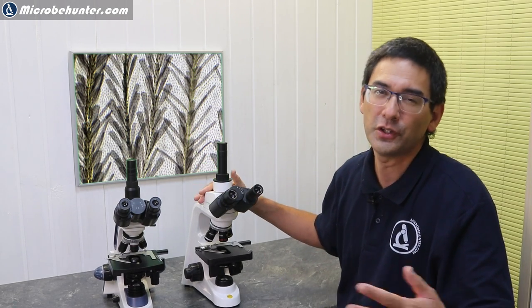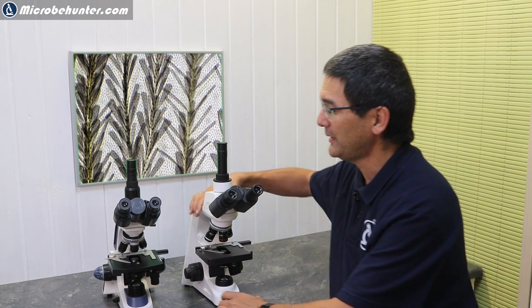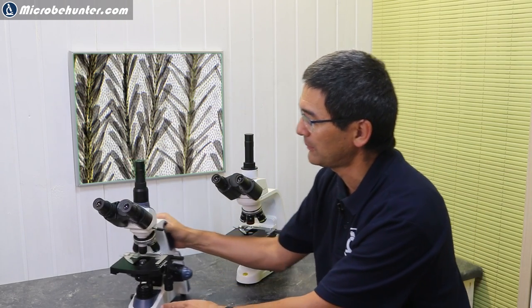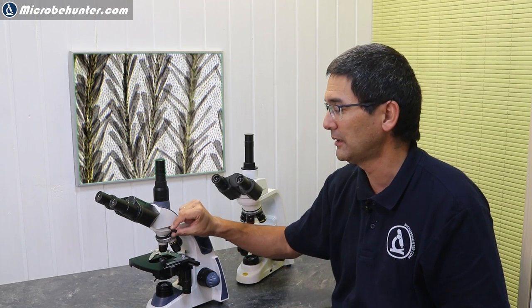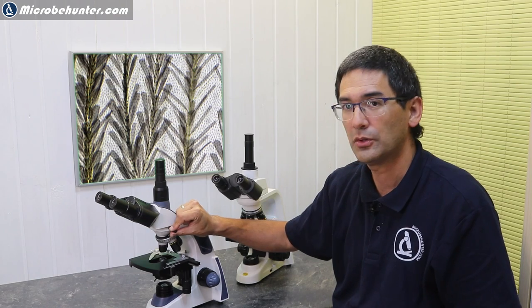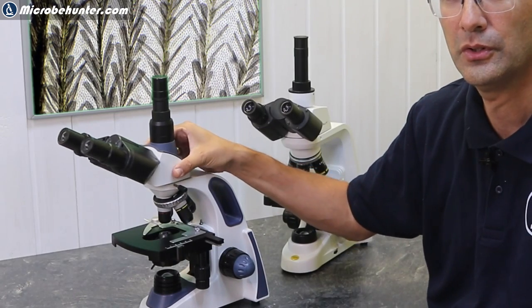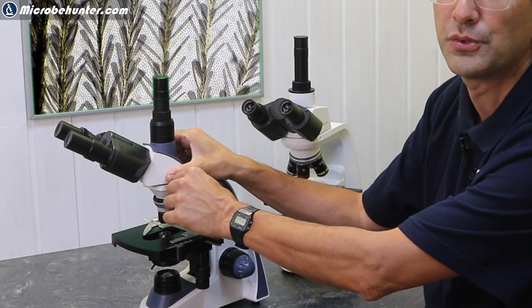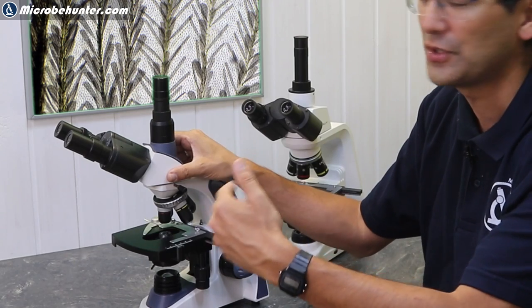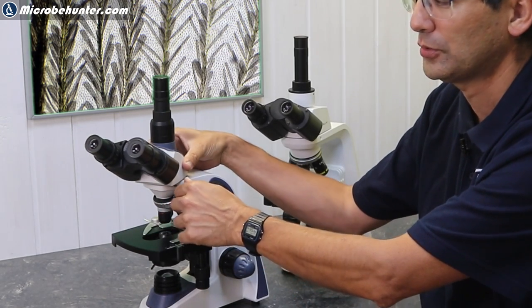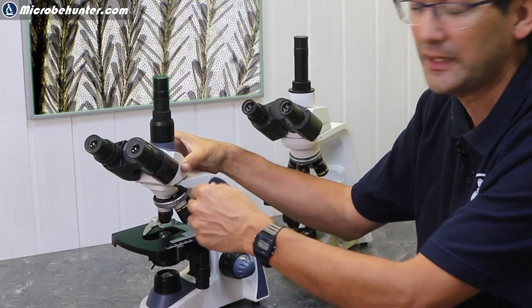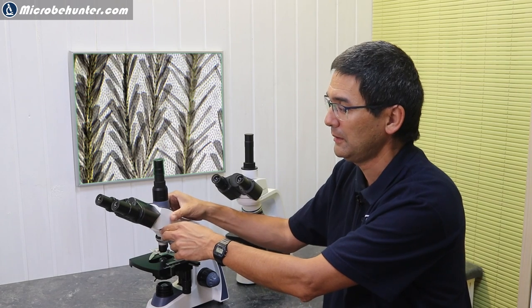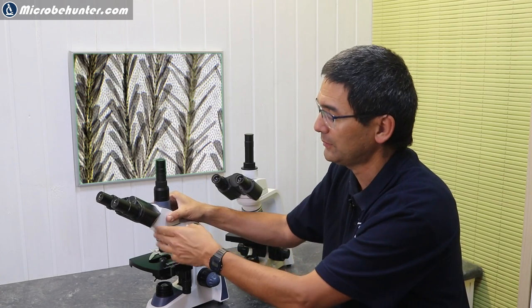Now is there a mechanical difference? There's one thing that I really wanted to point out. Here on the side there is a little screw knob that you can turn, and when you turn it you have to loosen it. Then you're able to turn the trinocular head, and then you're able to fix it again in position. For example, if there are two people using the microscope, you have to loosen it a little bit and turn it, then tighten it. If you don't tighten it, it's going to be a little bit wobbly. It doesn't go off—that's important—but it's not quite as stable, so you always have to tighten it a little bit.